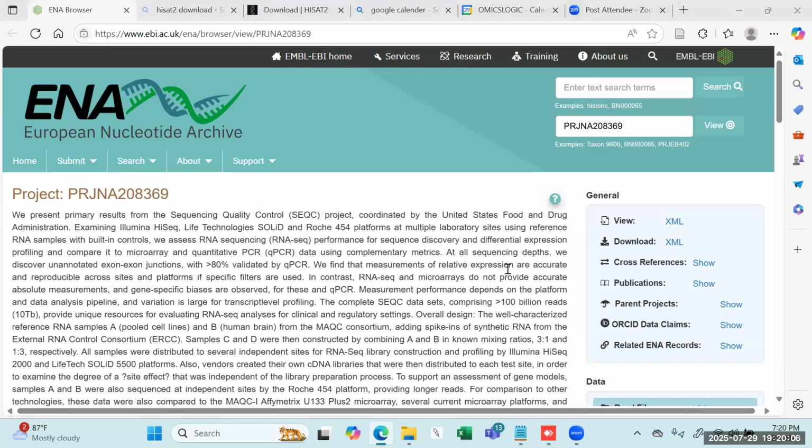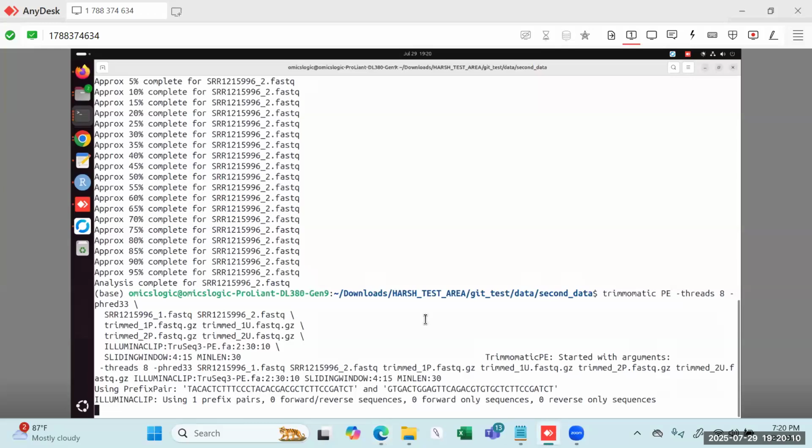If we talk about the process of alignment, we are going to align the reads to the reference genome and then make a comparison, right? But before that, there is a small step where we perform the indexing. That means we are going to index the entire genome that we have and convert it into more searchable, compressed data structures.